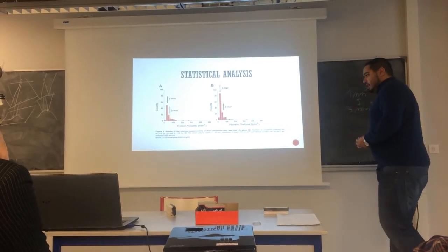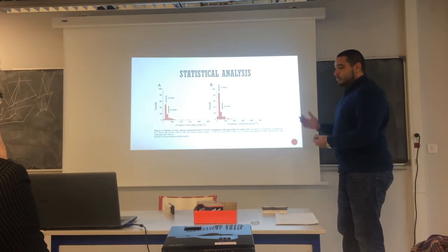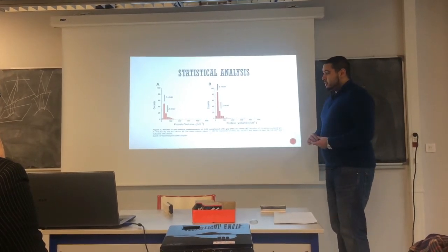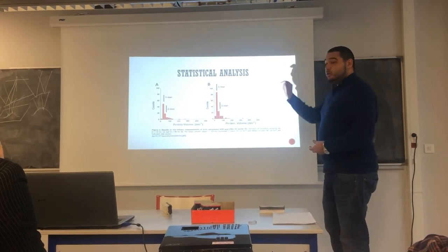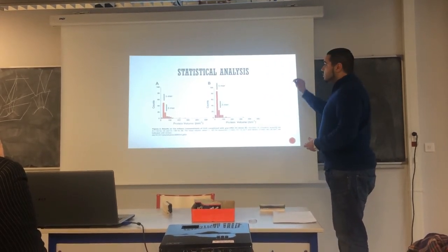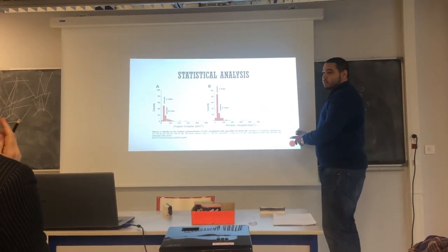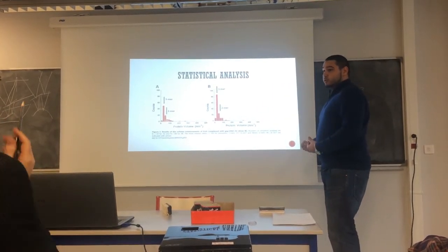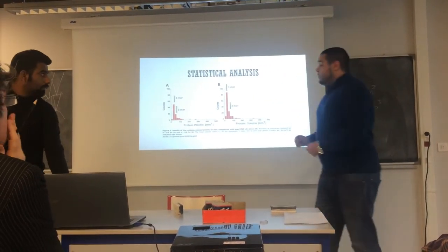Now, that being said, they can actually visualize the complexes between the DNA and the protein for very high protein to DNA ratios that are superior to 100. And this is a main difference between A3A and A3G, because A3G can do this in these experimental conditions for lesser ratios of protein to DNA. Now, I'm done talking about the wild type.